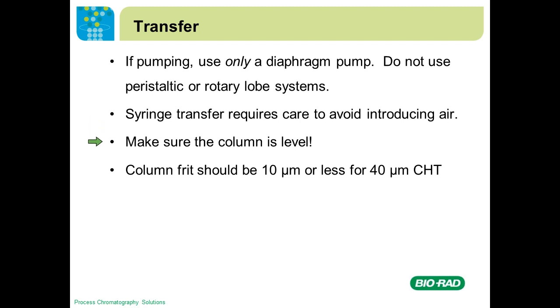Make sure the column is level — this is particularly important for packing CHT, and I'll come back to why shortly. If you are packing 40 micron CHT, the column frit should be 10 microns or less. CHT has a nominal particle size of 40 microns, but some particles are smaller. If you use a 20 or 22 micron frit — which is typical for most shipped columns — those small particles can plug the bottom of the column and lead to flow irregularities.